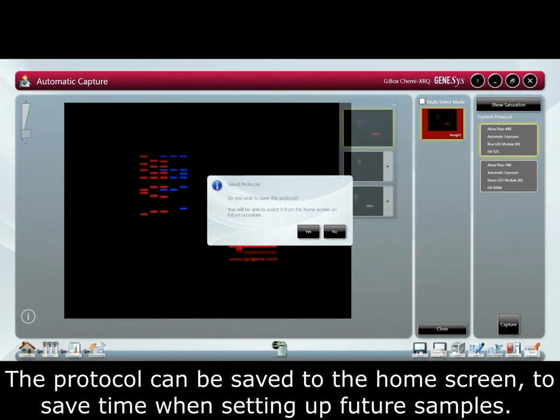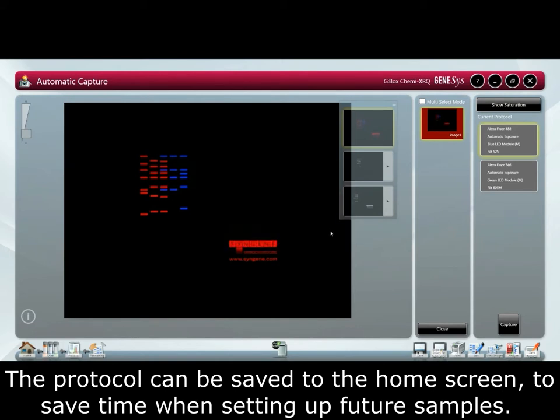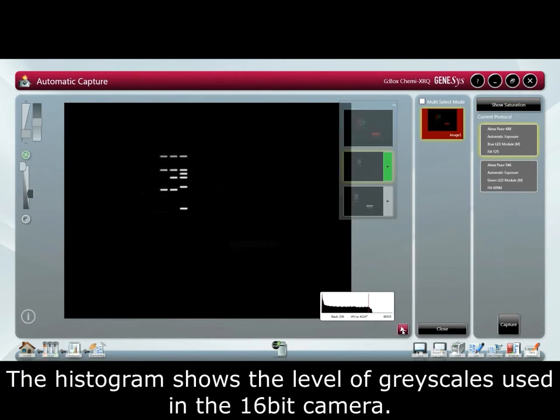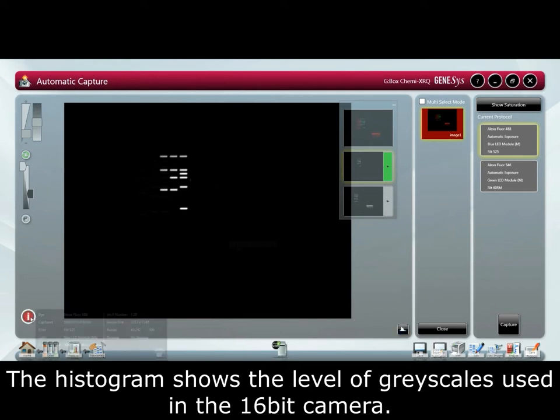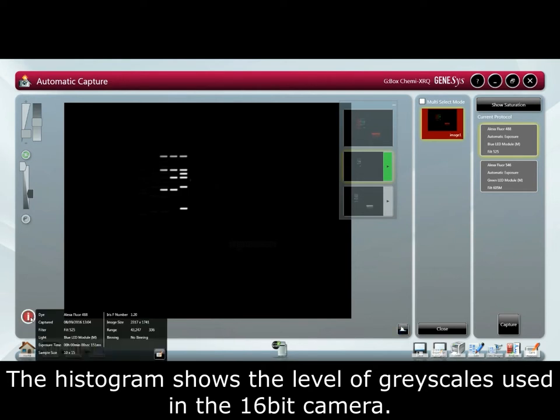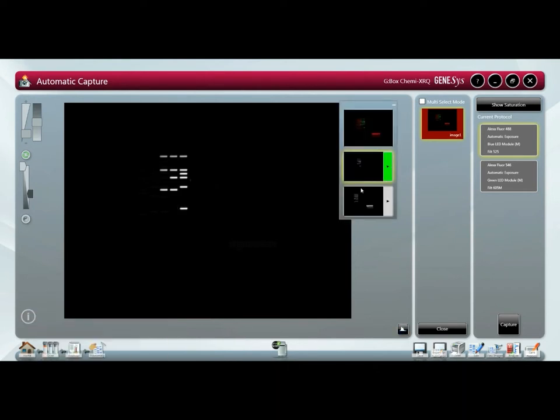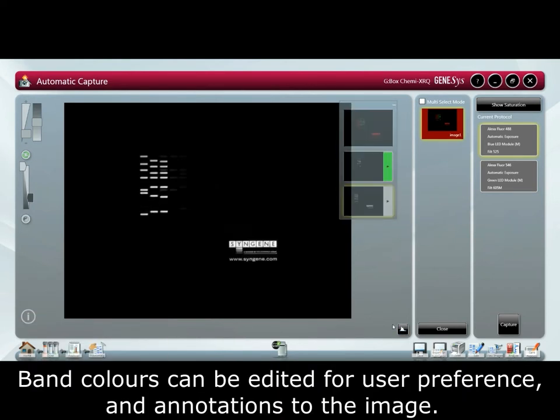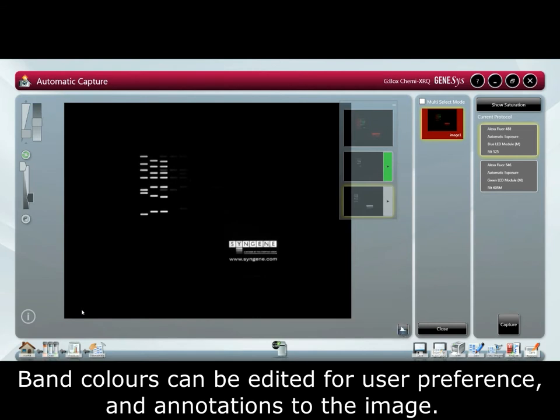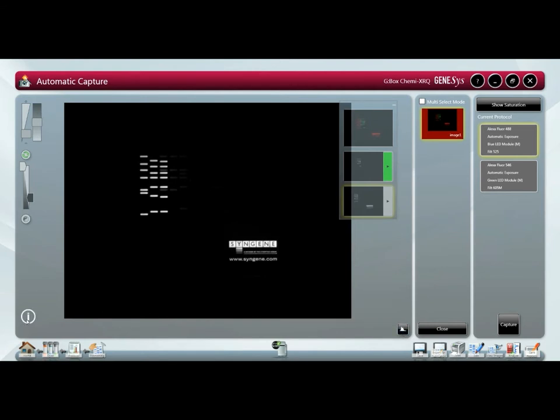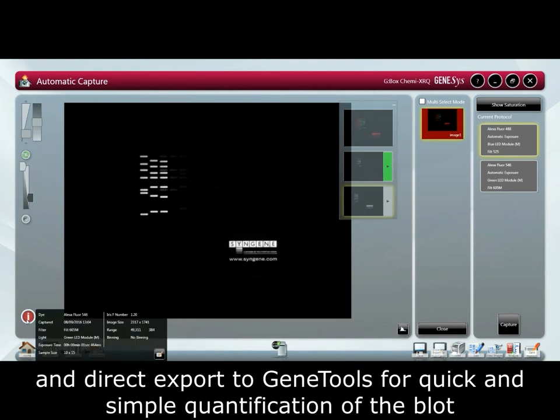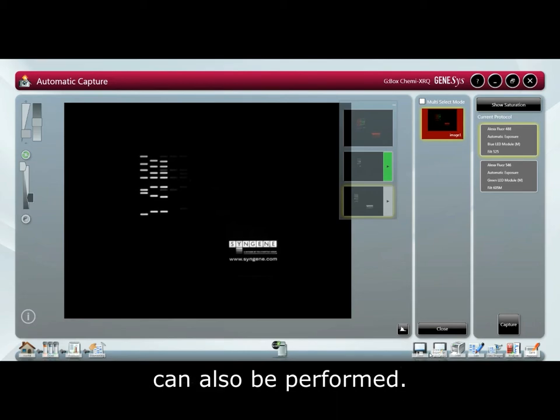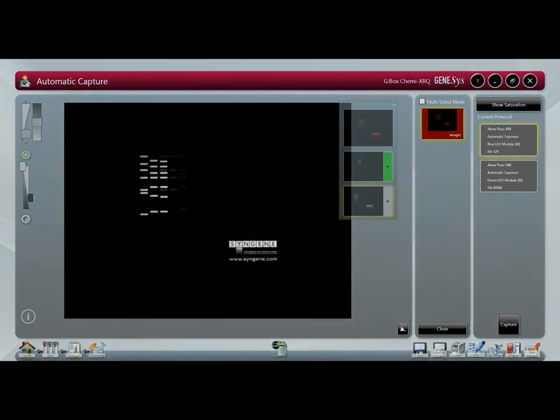The protocol can be saved to the home screen to save time when setting up future samples. The histogram shows the level of grayscale used in the 16-bit camera. Band colors can be edited for user preference, and annotations to the image and direct export to GeneTools for quick and simple quantification of the blot can also be performed.